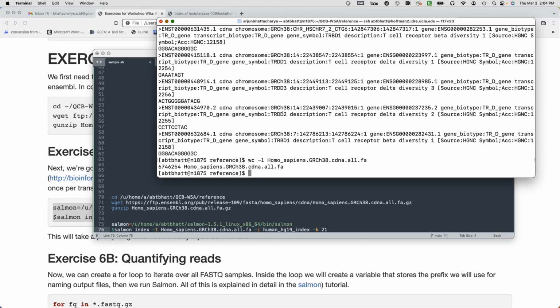So this is the push and pull of RNA sequencing here. You have to be very careful and very deliberate with what the goal is for your experiment, and accordingly choose a pipeline. The methods we used yesterday with STAR get us aligned reads to the genome. We can still use those aligned reads and process them in another way to identify exons that aren't annotated in our GTF file.